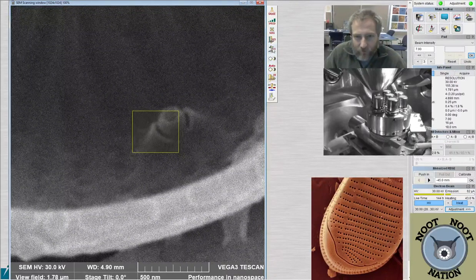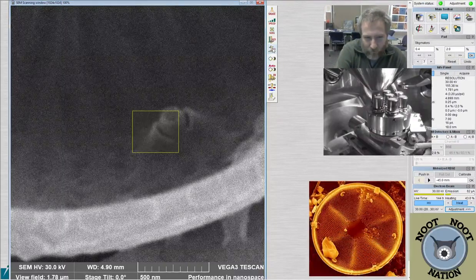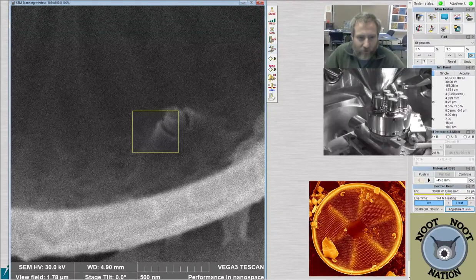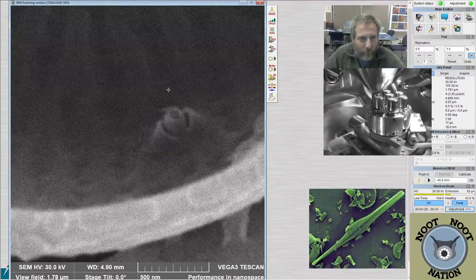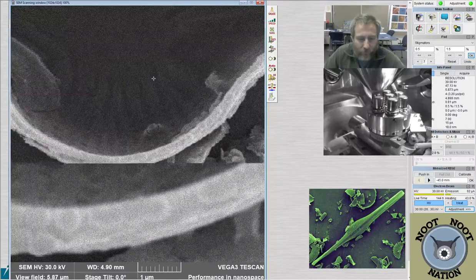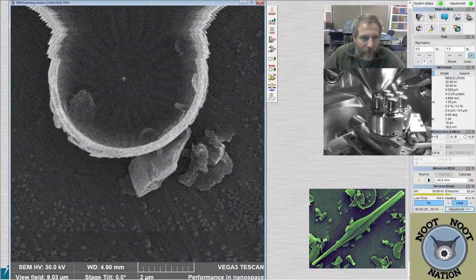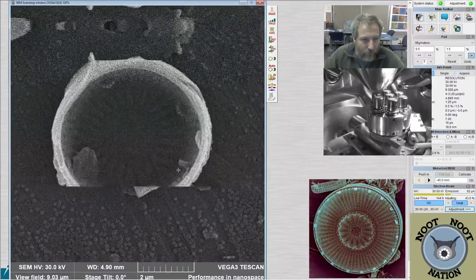I'm going to just see if I can tweak the settings a little bit to make it a better image. We may not be able to improve it any from there. Maybe it's at its sort of best conditions. I don't know. Maybe that's a little bit better. And then now that we have it in focus, I will zoom out a bit. And then we can get an image of this one as well.